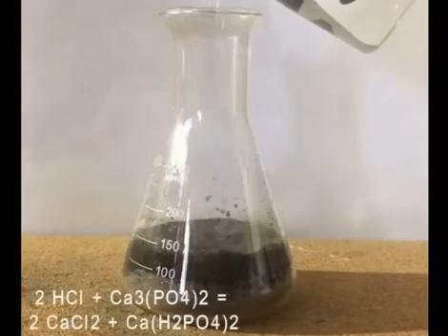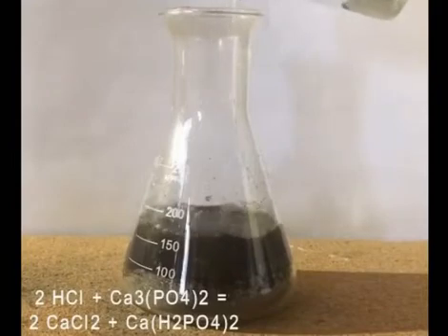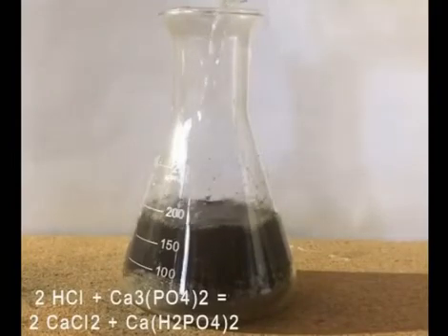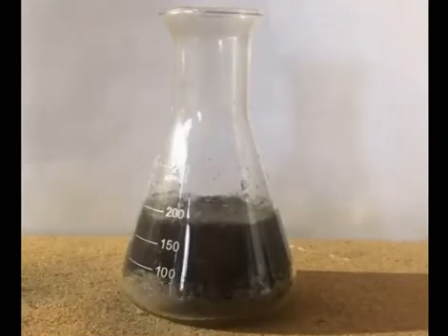In this step, the acid reacts with the calcium phosphate present in the bones to form calcium chloride and calcium dihydrogen phosphate — also called monocalcium phosphate — which solubilizes due to the low pH. After the acid addition, the solution is stirred for a bit and left to react for a few days.